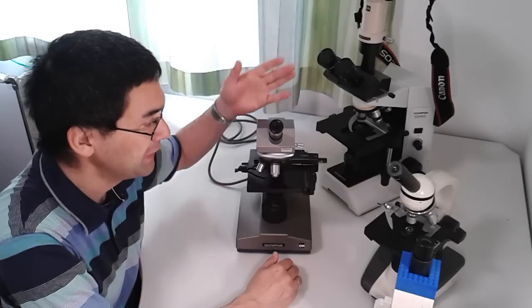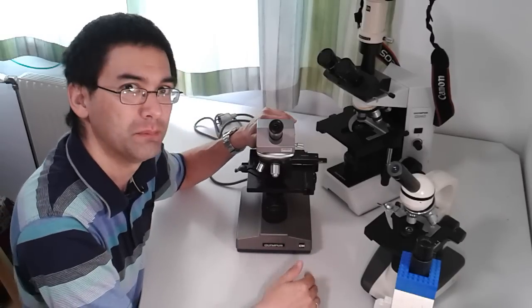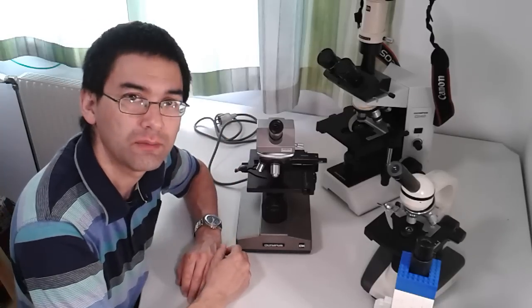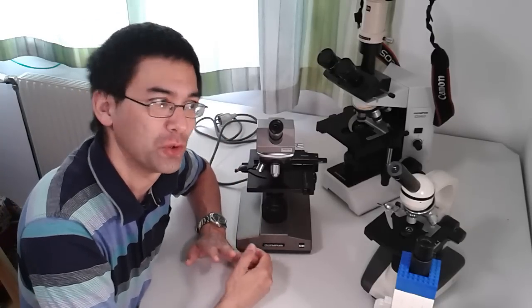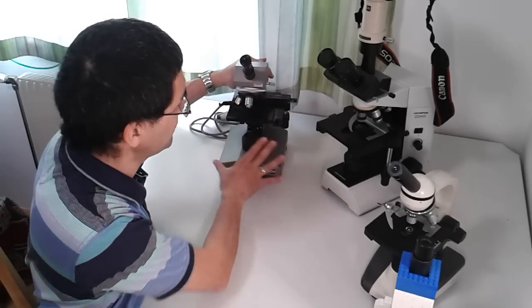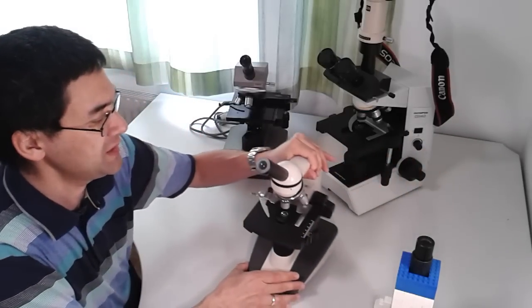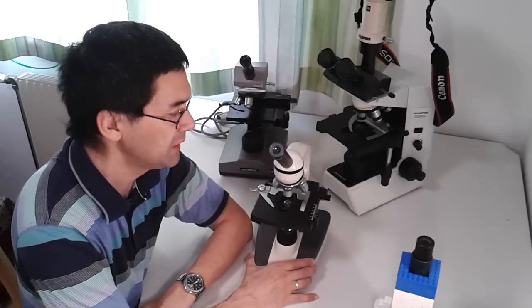After the complete service and cleaning, the CH-A works perfectly again. However, the service alone cost around €200 — for that amount of money you can already buy a separate microscope. But I had to get it done because it's such a beautiful device.